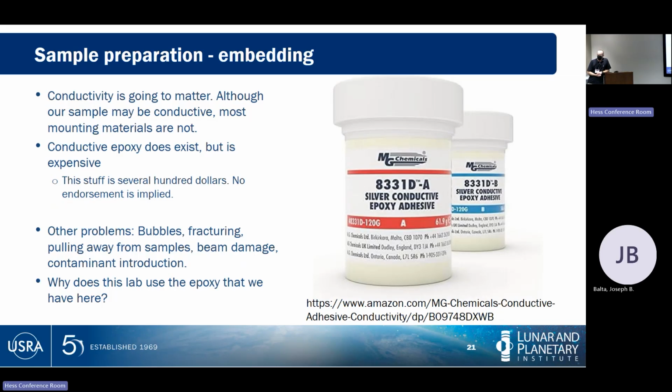Epoxy is typically non-conductive. It is an organic molecule. So it's going to be a low Z number when we go to backscatter. It's going to be pretty dark.